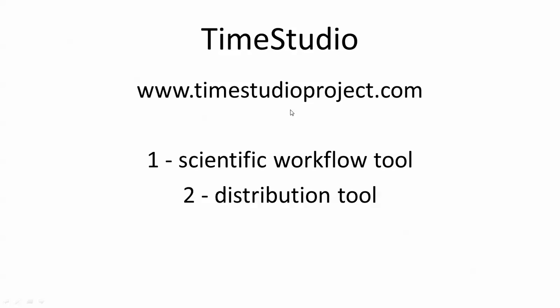Second, TimeStudio has an integrated distribution tool. So getting your studies done is one thing, but getting them used is equally important. Therefore, TimeStudio allows you to upload and share your studies from within the main program, and it is equally easy to download and run workflows that have already been published. And even better, the distribution tool will help you collaborate and design workflows with other labs using TimeStudio.